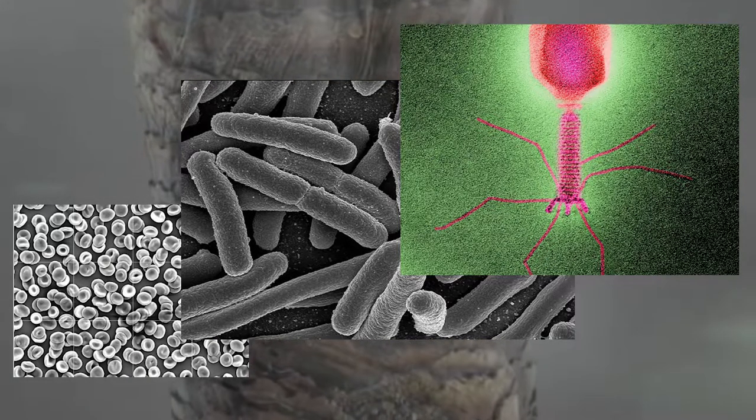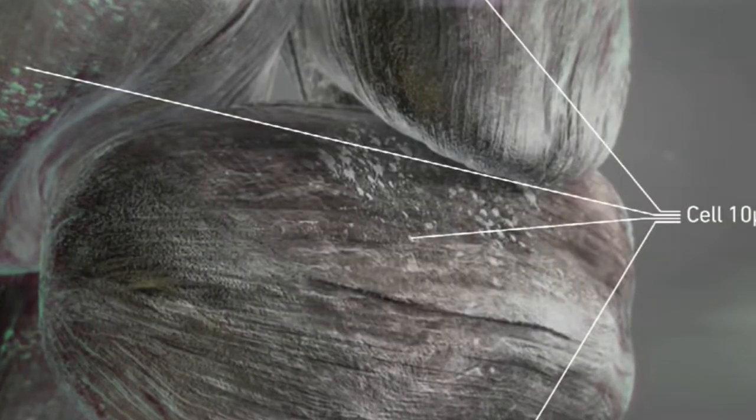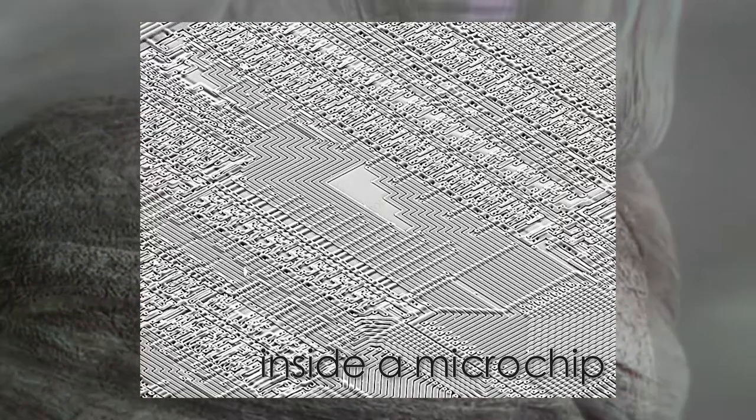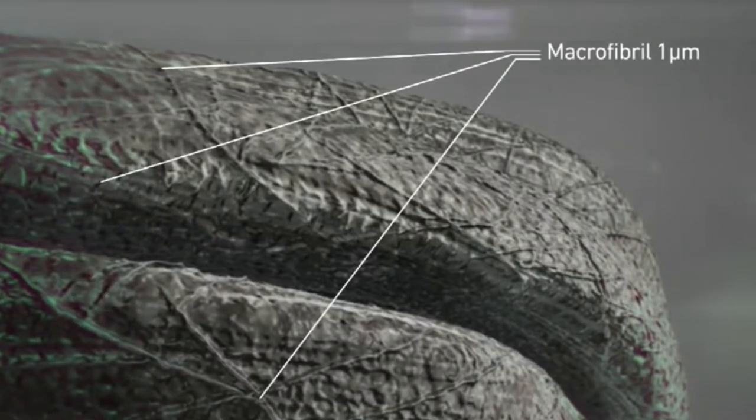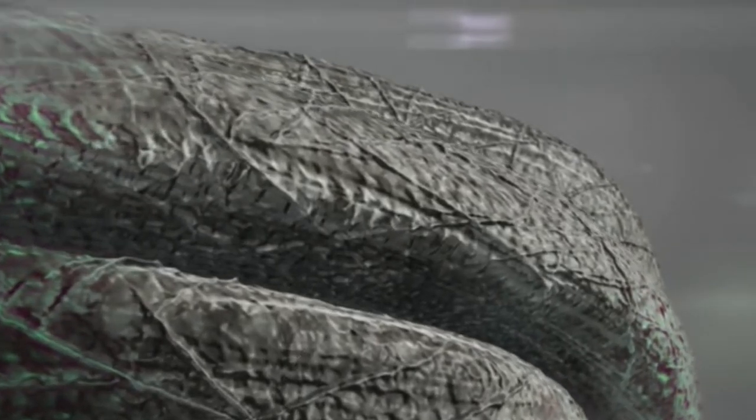In a material research lab, one may need to see the details of a material surface. In a solid-state physics lab, one may need to take a close look at a nanodevice. But how is this done in a lab? How do we observe tiny objects that we cannot see with our naked eye?